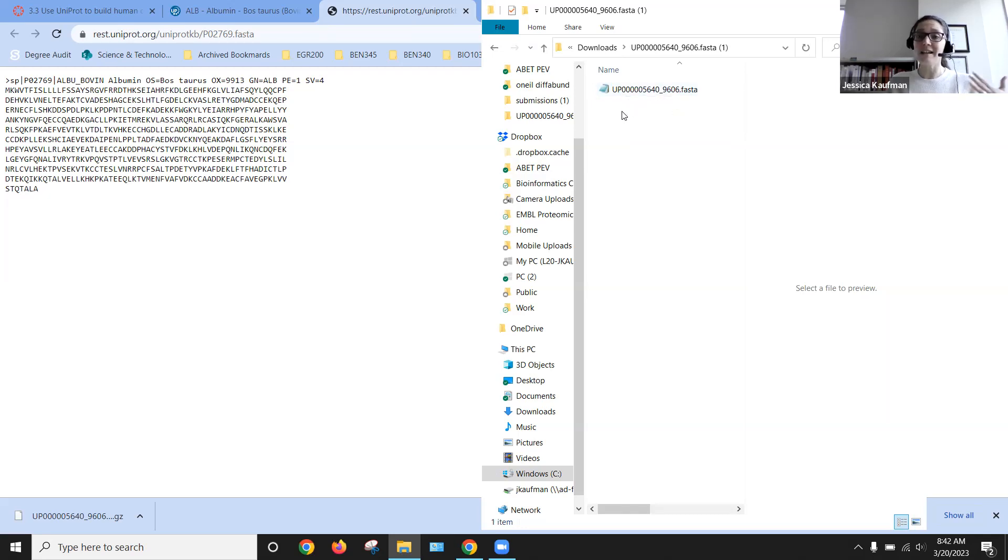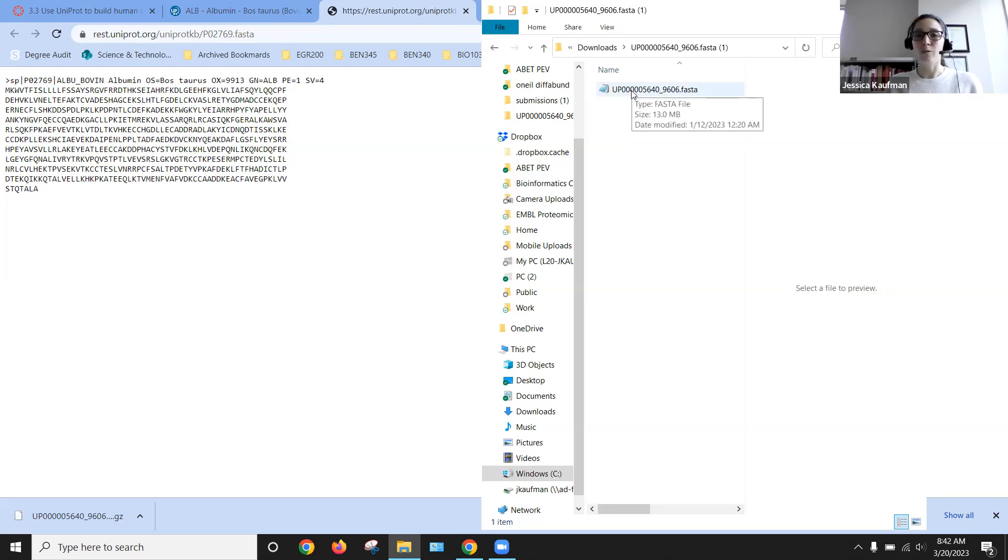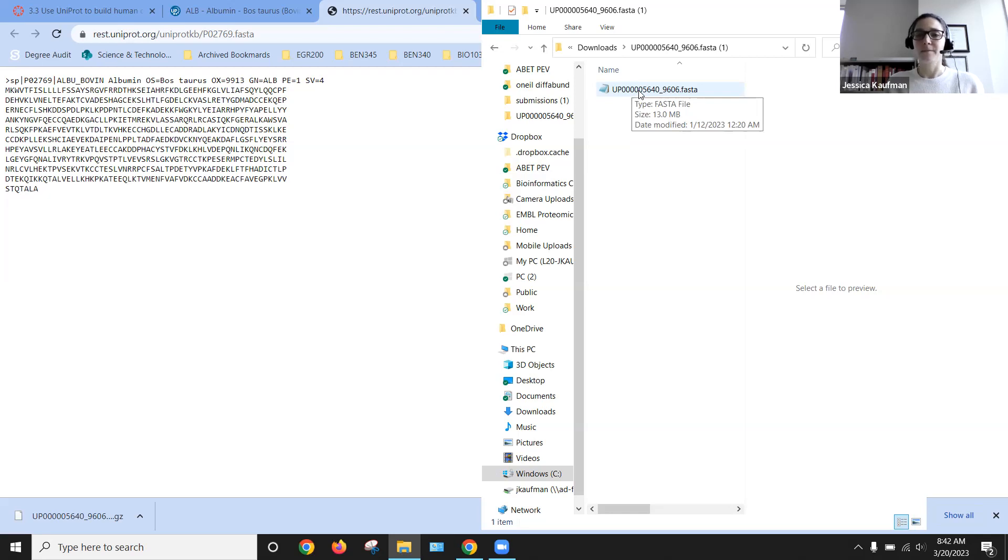And then we can open it up in any text editor. So you can download a text editor that you would use for writing code, something like Sublime or Notepad++. Or you can just open this up with tools that are already on your computer. So for PC, that would be Notepad. For Mac, it would be TextEdit.